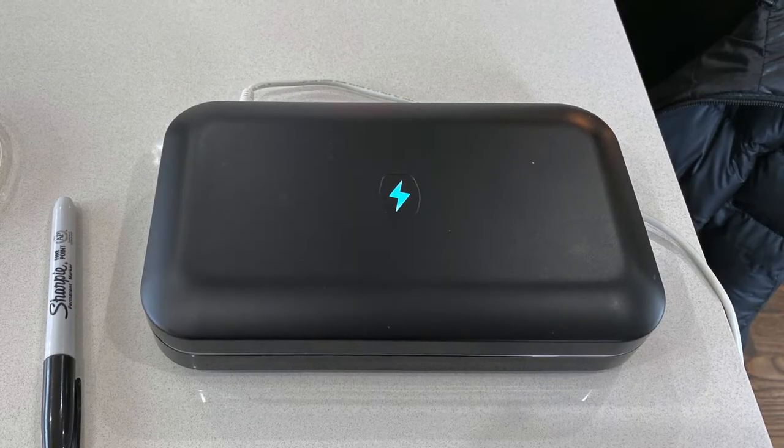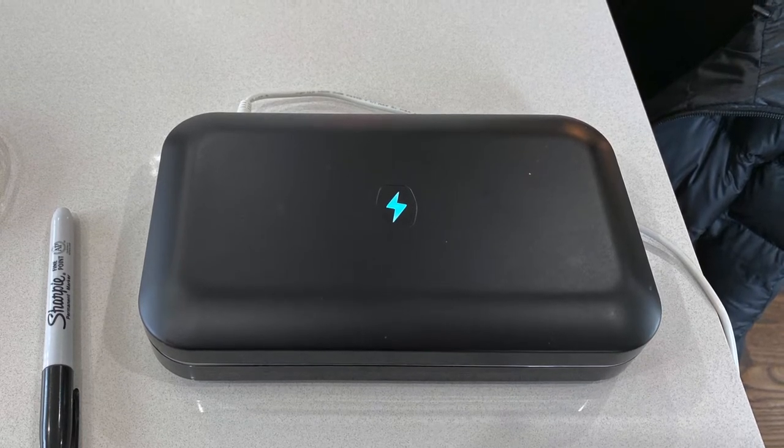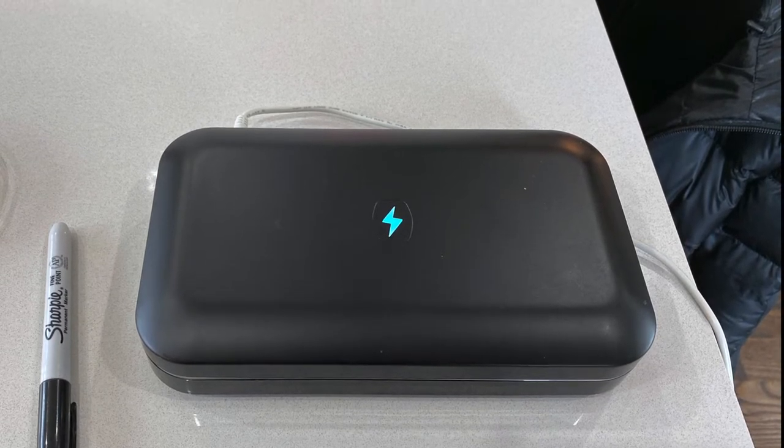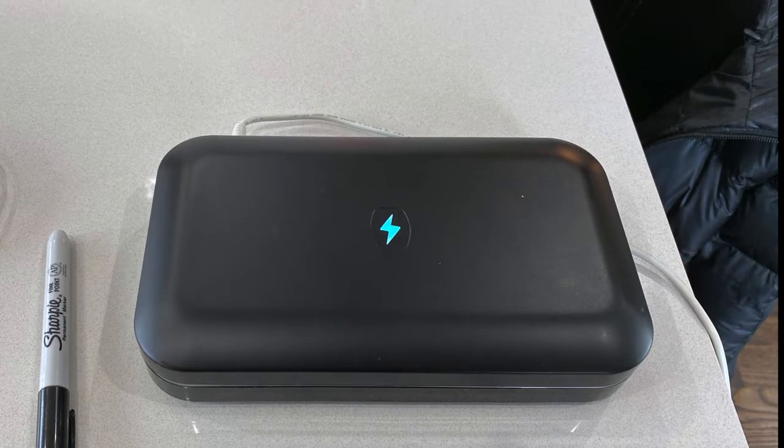You may have heard of PhoneSoap. It uses UVC light in a contained environment to break apart cells from bacteria and viruses. You can fit most phones, keys, cards, whatever else that's small. I've had this one for about a year now. I use it almost daily on my phone to make sure it stays sanitized. And I am now putting it to the test.